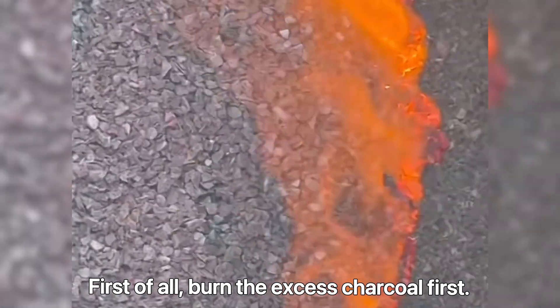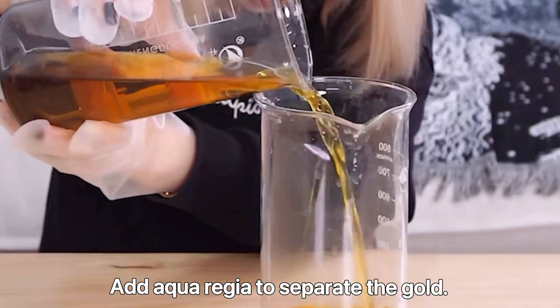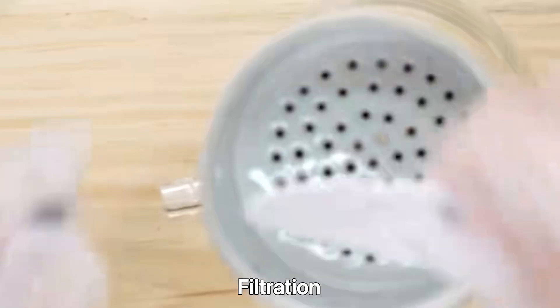First, burn the excess charcoal. Then add aqua regia to separate the gold, followed by filtration.